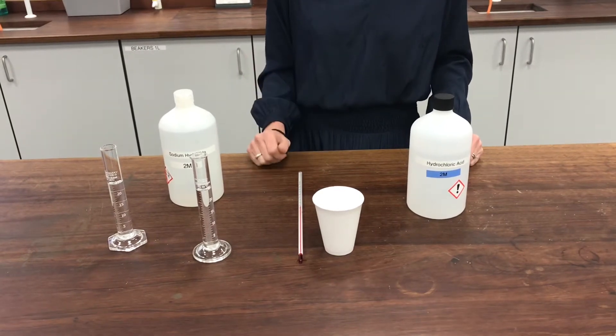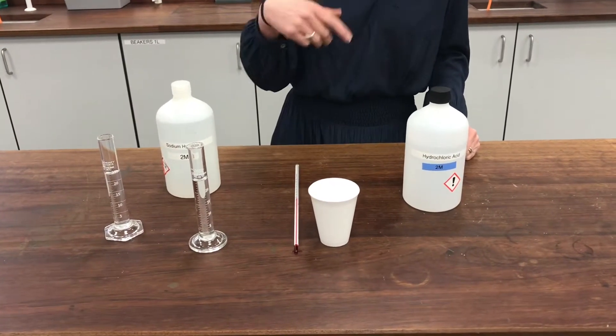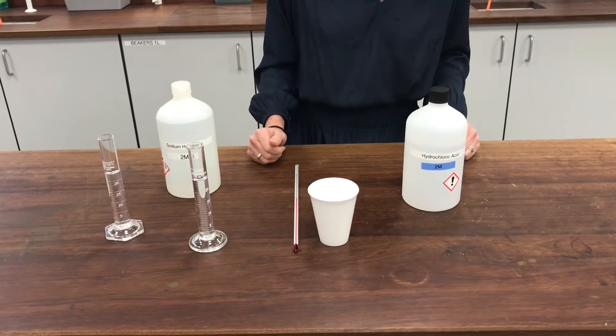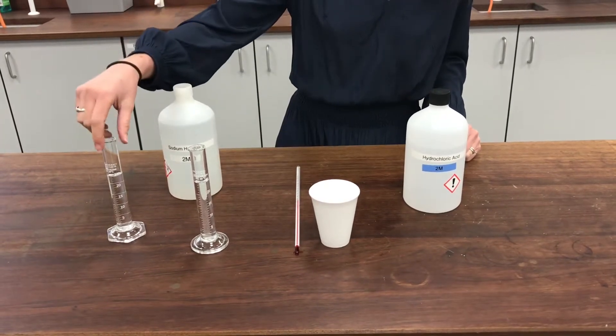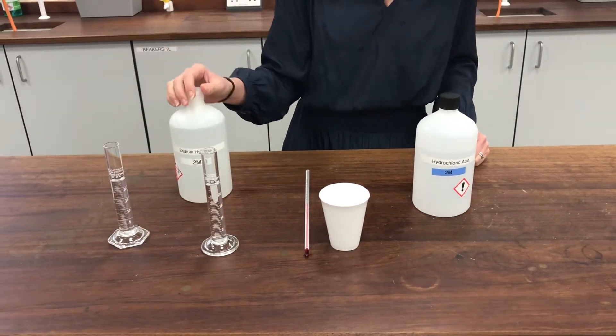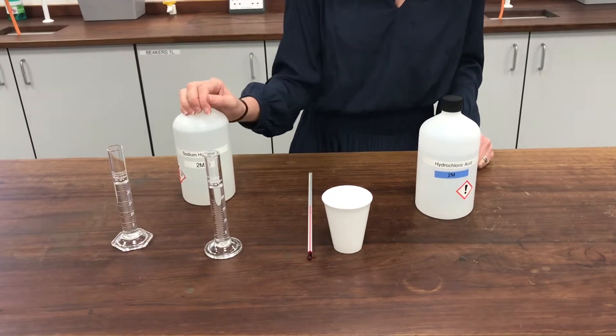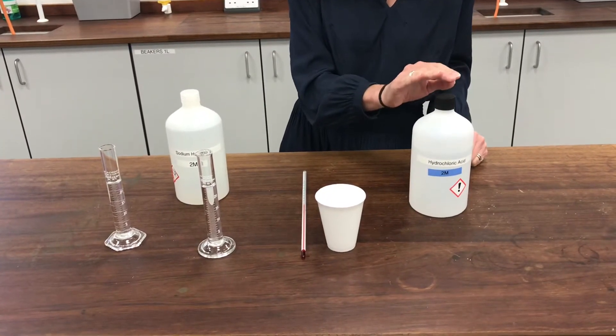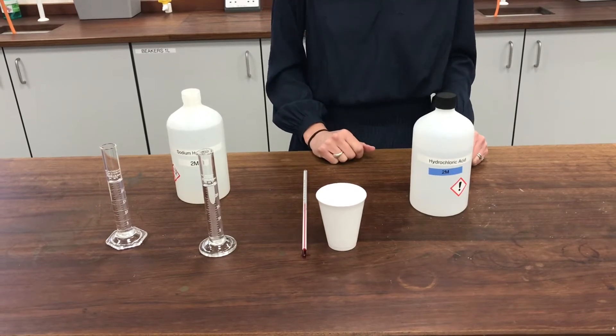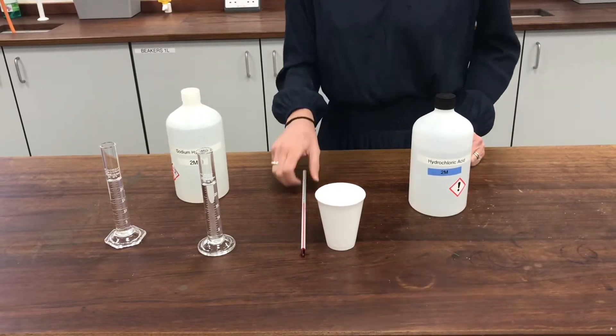We can see whether the temperature goes up or down. When we've recorded that maximum temperature change, I'm then going to add another 25 millilitres of alkali to it. Now at that point, I'm hoping there will be no acid left for it to react with. We can have a think about what might happen to my temperature at that stage.